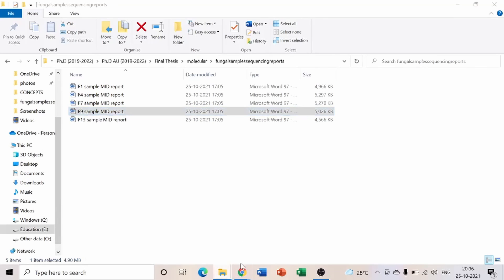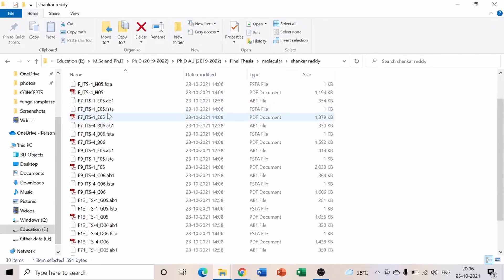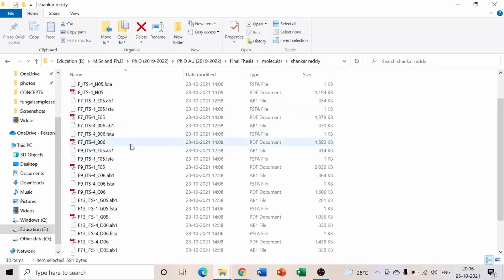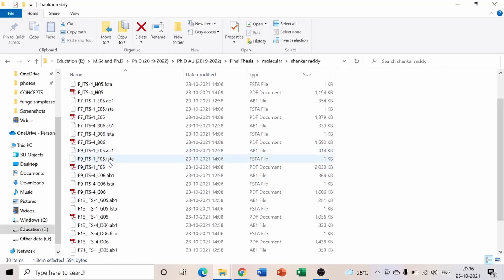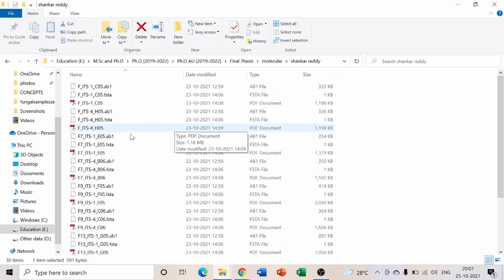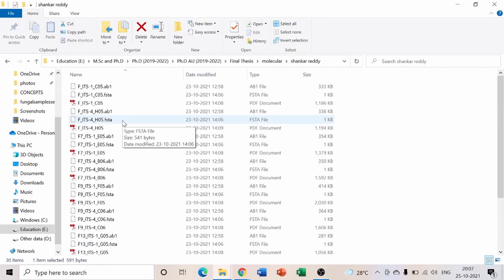The first file is a FASTA format file. It will show the isolate label — for example, whatever you wrote on the Petri plates will appear here. If the isolate number is F7, they give F7; if it's F9, they give F9, with ITS1 primer and ITS4 primer FASTA files provided for each.